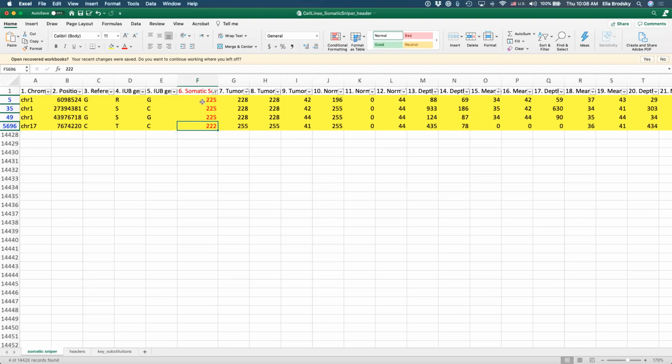Again, it depends on your threshold. This was highlighted just for the example to talk about these mutations, but obviously when you do your own analysis, you will be able to set the threshold yourself. This is just an example that we're going through to explain how this works. Here, we're just taking these 4 mutations to look into them and try to understand what they mean. Does that make sense, Irmak?